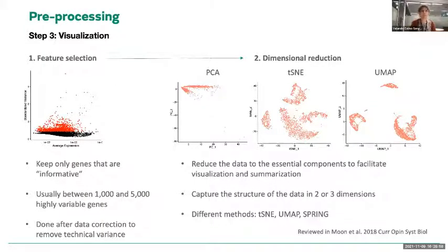While the UMAP is better at telling, oh, this cell is quite different from this other, so we will put it farther away, but then there is this other group of cells that is even more different, so that one is going to be even farther. So basically, the distances in the UMAP are more representative of how different the things are, while the distances in the t-SNE are not so good at telling how different things are.